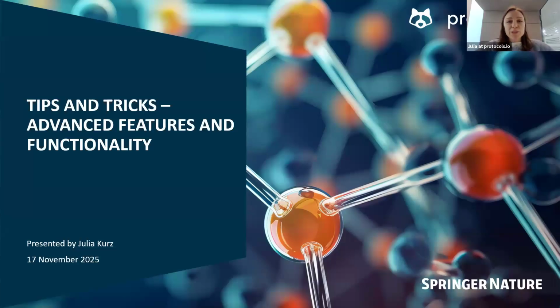Thanks everyone. My name is Julia. I'm a scientific engagement manager here at protocols.io. Today you are at the tips and tricks webinar. This is a little bit more of an advanced webinar where I'm going to be diving into practically using protocols.io and some of the more advanced functionality.